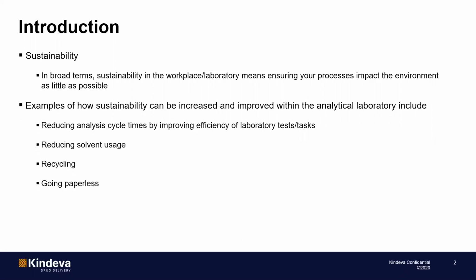Some examples of how sustainability can be improved within the analytical laboratory include reducing analysis cycle times and improving efficiency of laboratory tasks, reducing the amount of solvent we use, recycling, and also going paperless.